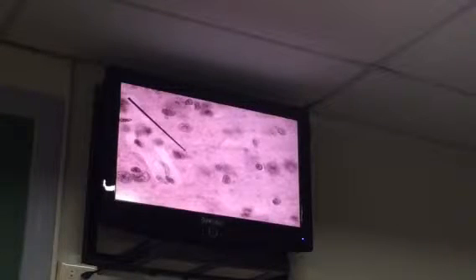They range from large to small. So the small one, you can easily see the triangular shape of this cell. It's the pyramidal cell of Betz. That is the characteristic cell or parenchyma of your cerebral cortex. Okay? So just one cell to look for, the pyramidal cell of Betz. Try to look for bigger ones.